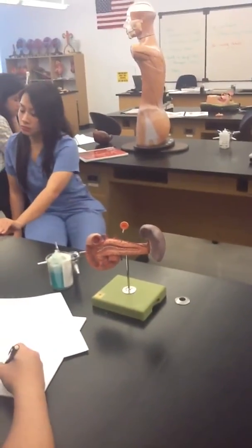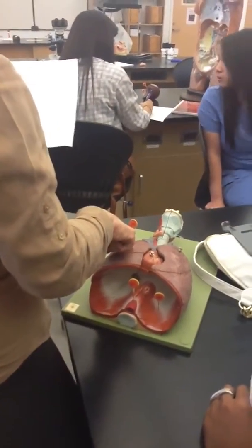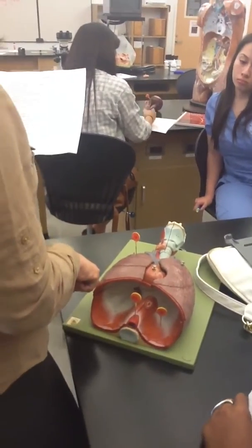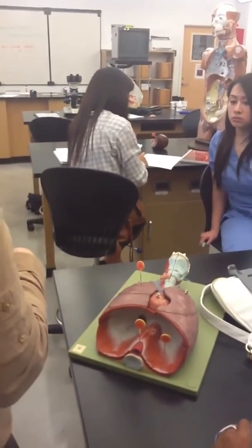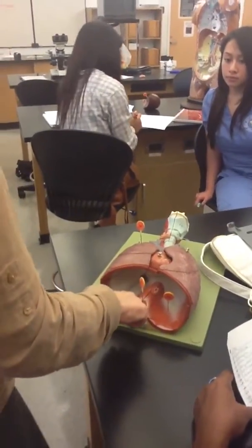Okay, 34, over there. What is 34? What is that gland? Pancreas. Very nice. 35 is a long slide. 36, what is 36? This is a superior lobe of the right lung. As you know, the right lung has superior, middle, and inferior lobes, and the left has just the superior and the inferior due to the cardiac notch. That's good. And 37 is abdominal aorta.